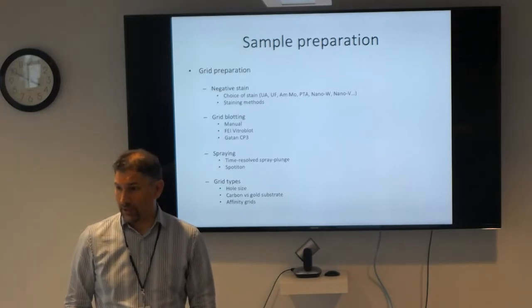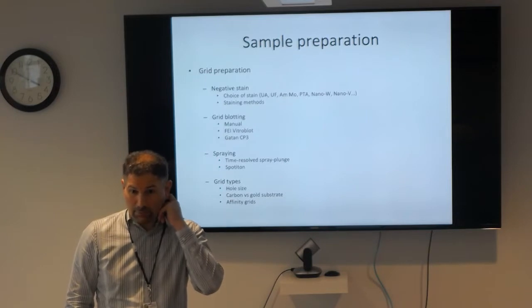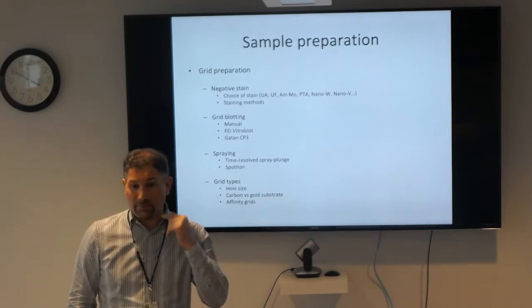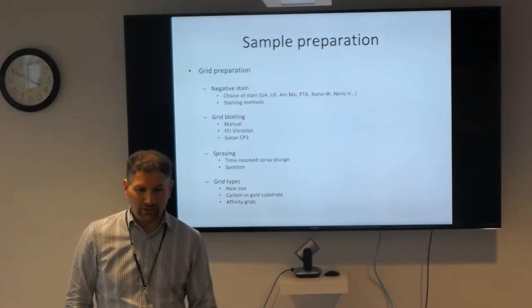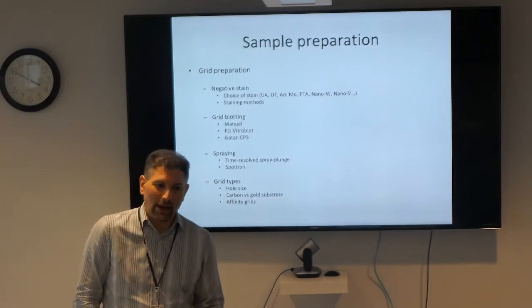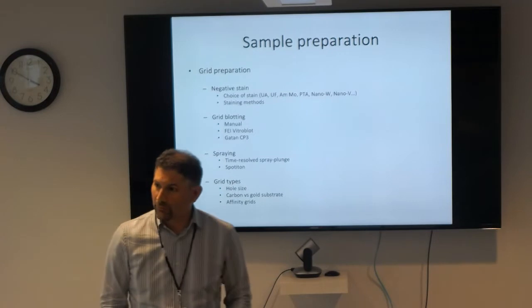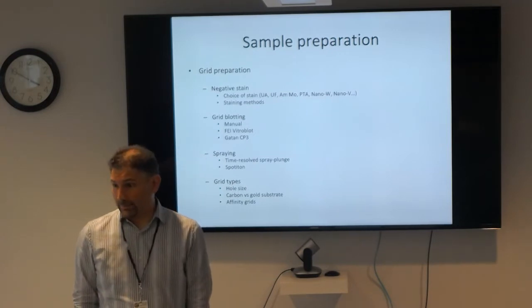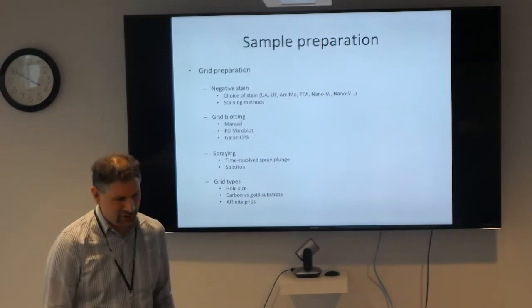One of the difficulties with gold is that the grids are great, and you can buy the grids, which makes them even easier. The problem is when you put in the order, it tends to be back ordered for quite some time. Because of that, we're a little bit cheap with using these things, because if we run out, then I have to wait 2 months, and now everything slows down. That's pretty good. Sometimes we're back ordered like half a year. Yeah. So we've been getting lucky, but this is something we have to worry about. Okay, and it's also the cost.